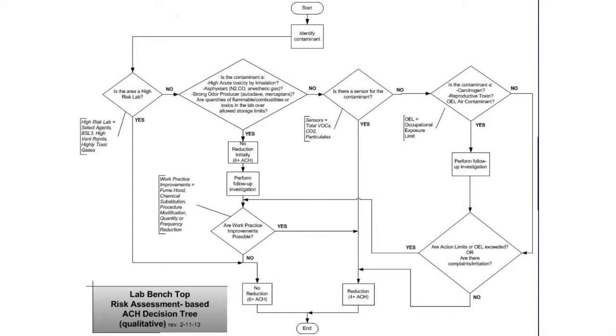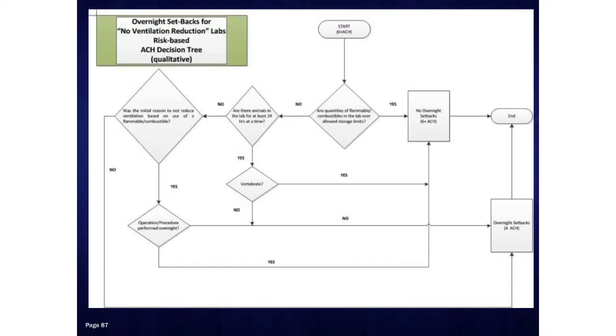If you look on the back page, I'm going to walk you through a second scenario, a little bit more complex. In the second scenario, we have a chemical engineering lab that researches the synthesis of nanomaterials, and lab staff use hydrogen sulfide in a chemical deposition oven. Now that hydrogen sulfide flows through one end and exhausts out the other of that oven. Initially, this process was performed on an open lab bench.